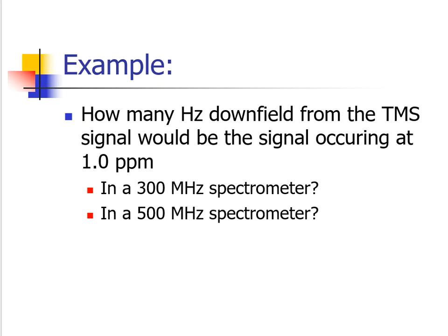So this is the idea that different NMRs are made in different ways, of course. That's one of the reasons that they're different. And sometimes we're applying a stronger magnetic field onto these molecules than other times. So it really depends on what I'm using, what I'm doing, what type of instrument that I have. And depending on that machine, the signal that I'm seeing from these could slightly be different.